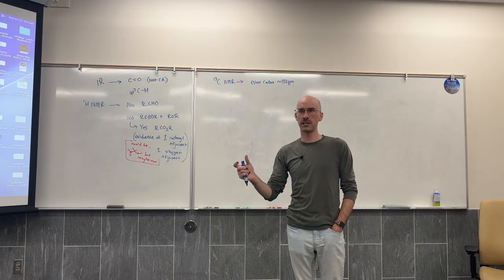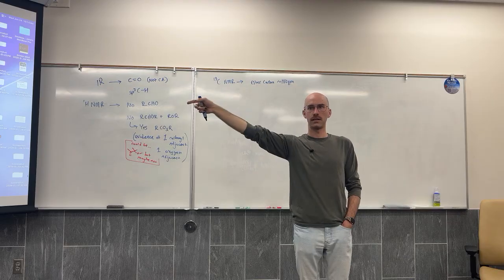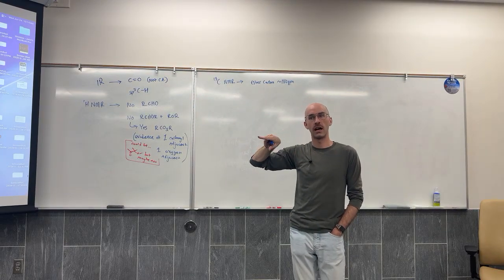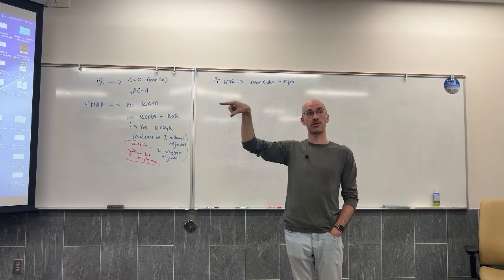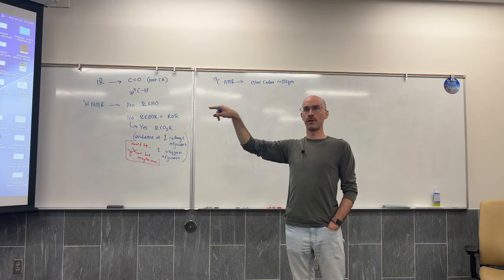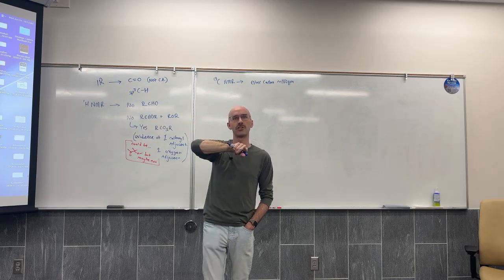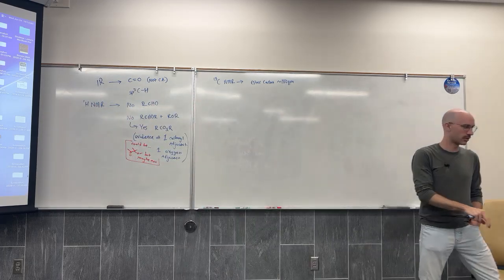Just because a hydrogen adjacent to a carbonyl shows up further left, a carbon attached to a carbonyl should show up further left, but not as far left as a carbon bonded directly to an oxygen, just like hydrogens show up even further left when they're bonded nearer to an oxygen.